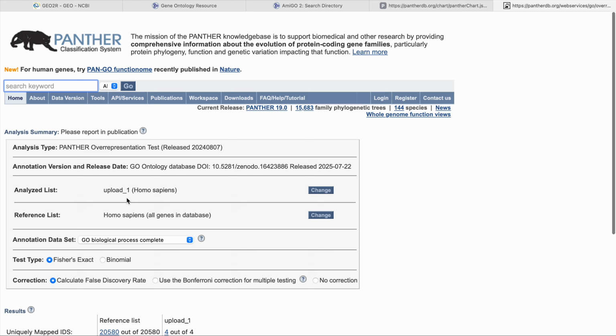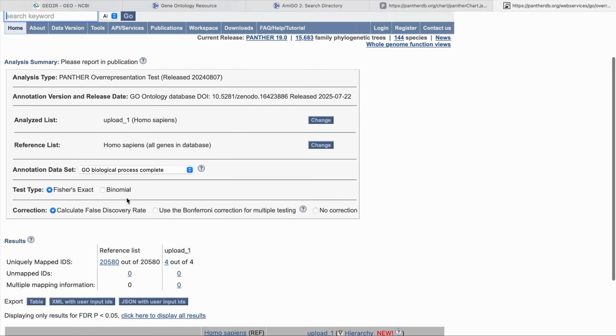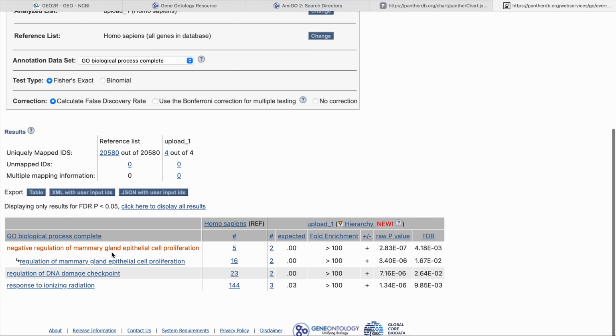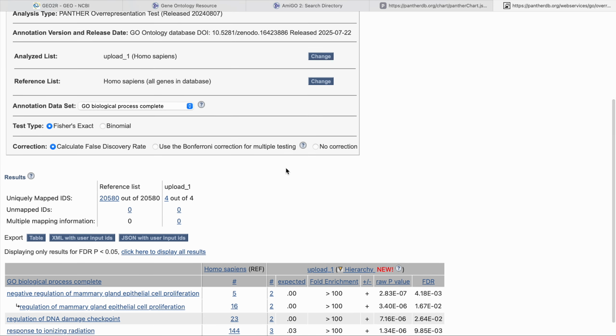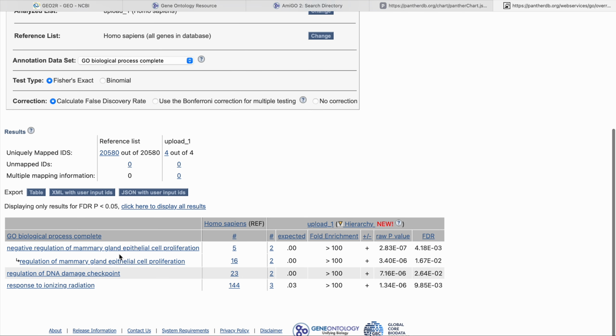So why this particular classification system? Because of course anything which has a family starts with a root node, and likewise it goes beyond. Then you have the categories and the subcategories. So here you can see, as we have used BRCA1, an abnormality or anomaly in that particular gene leads to breast cancer.